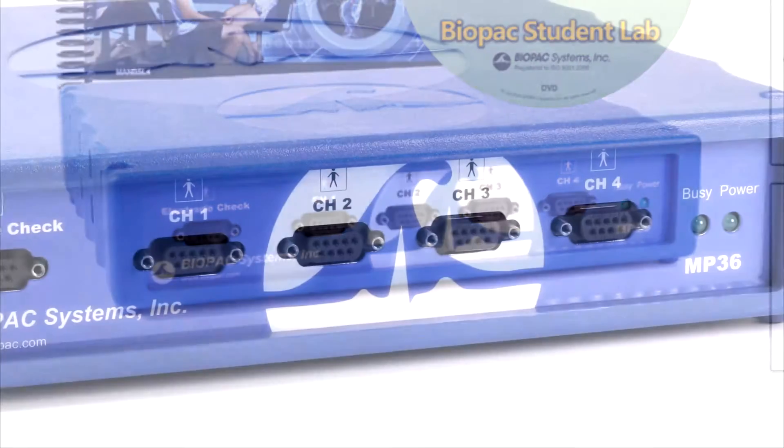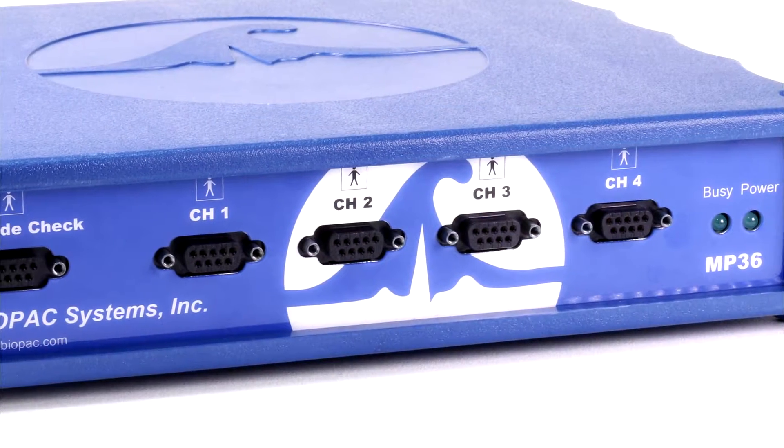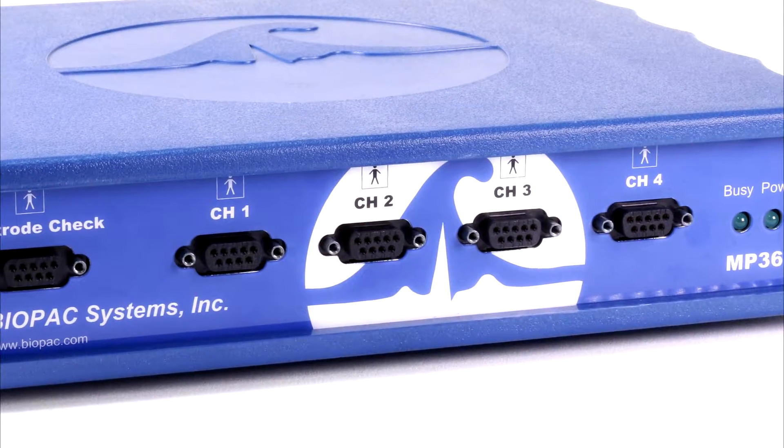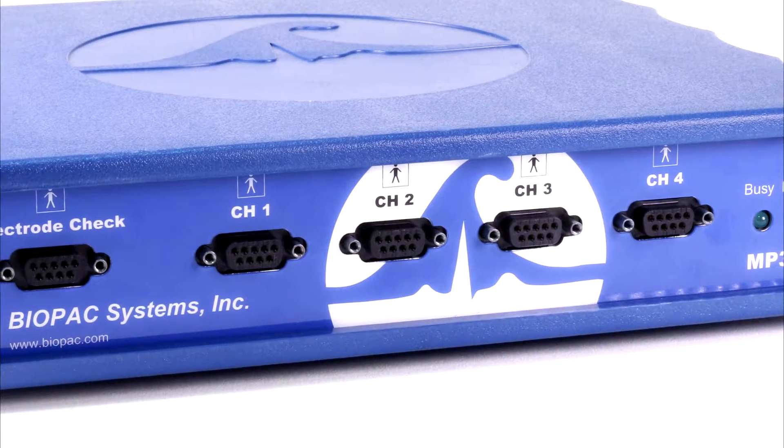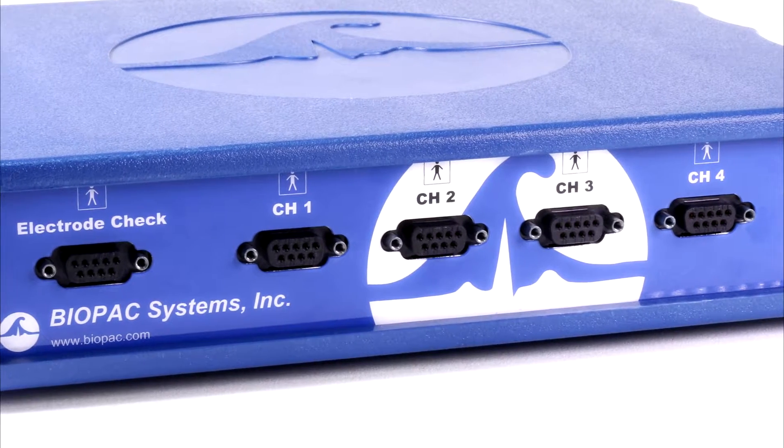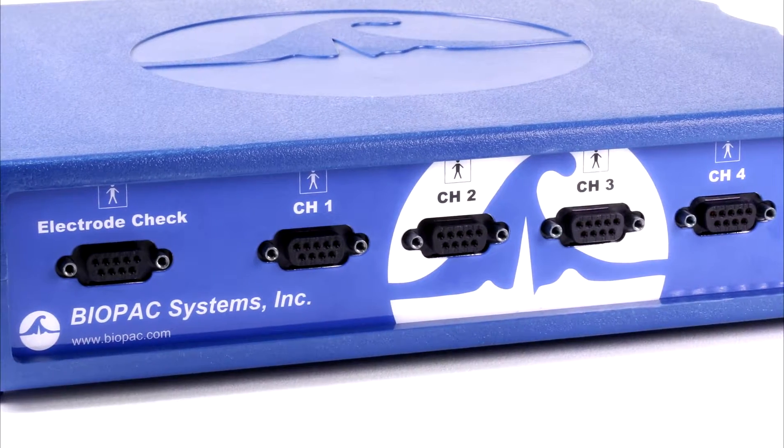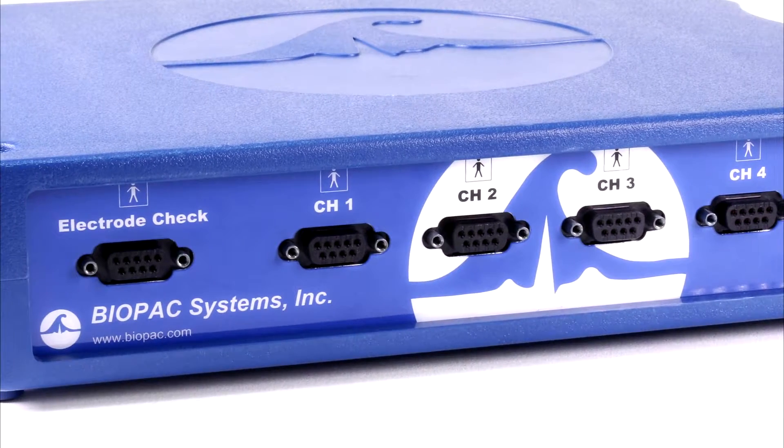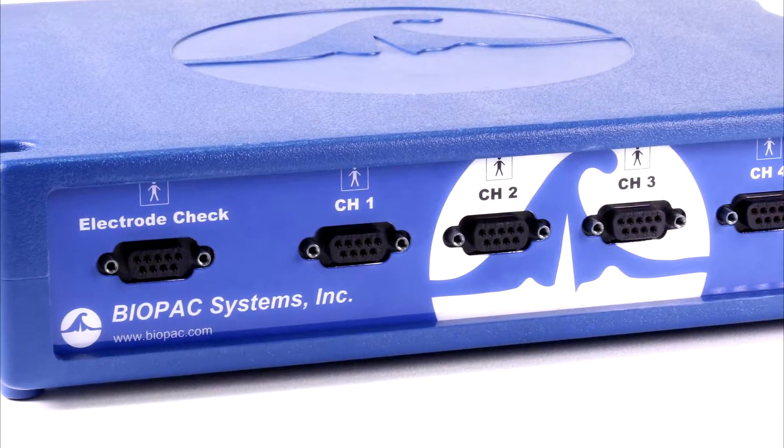With four universal analog input channels, data can be recorded from a wide range of signal sources including electrodes, transducers, I.O. devices, and stimulation.